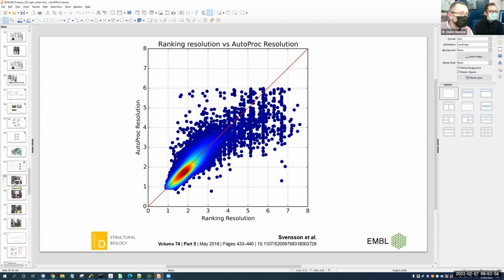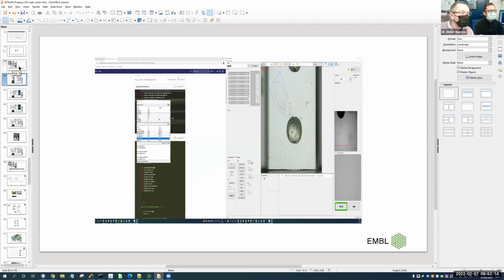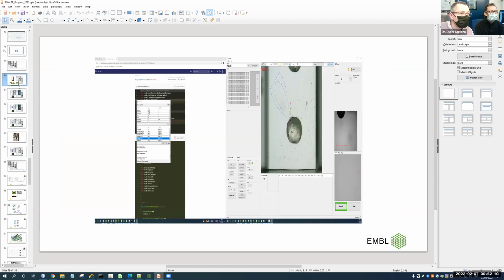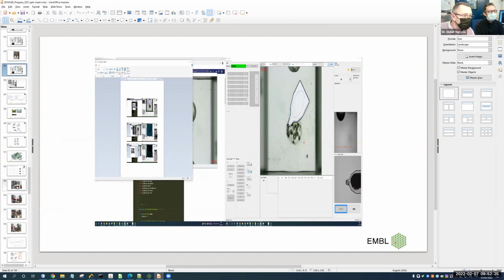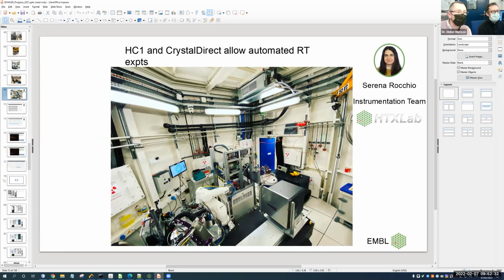Okay. Right. So Serena said this morning, we're currently changing the beamline quite significantly. I can find my slide. It isn't very good, but anyway, I wanted to talk a little bit about what we can do with the harvester now that we've got it mounted.